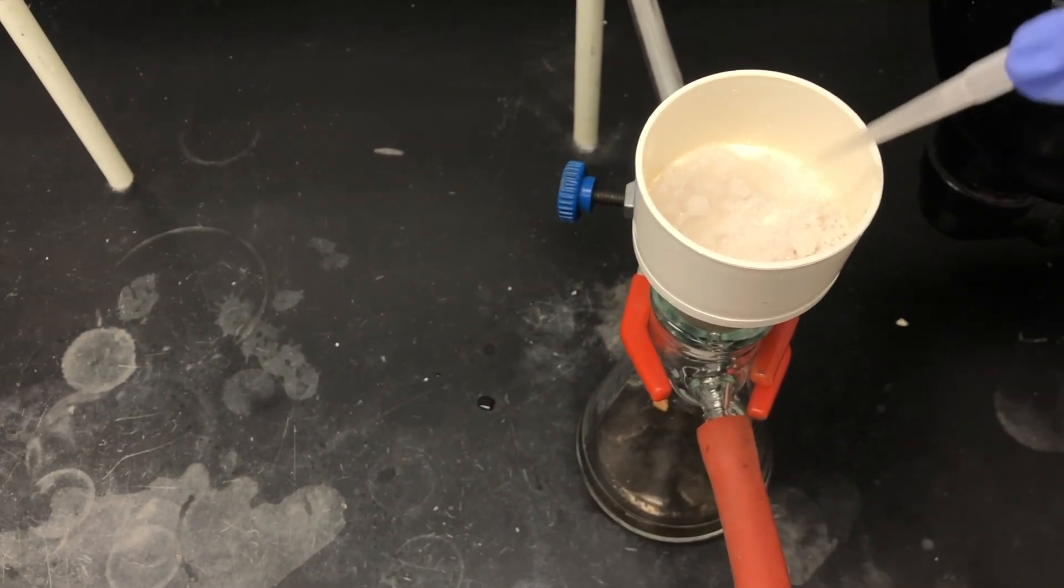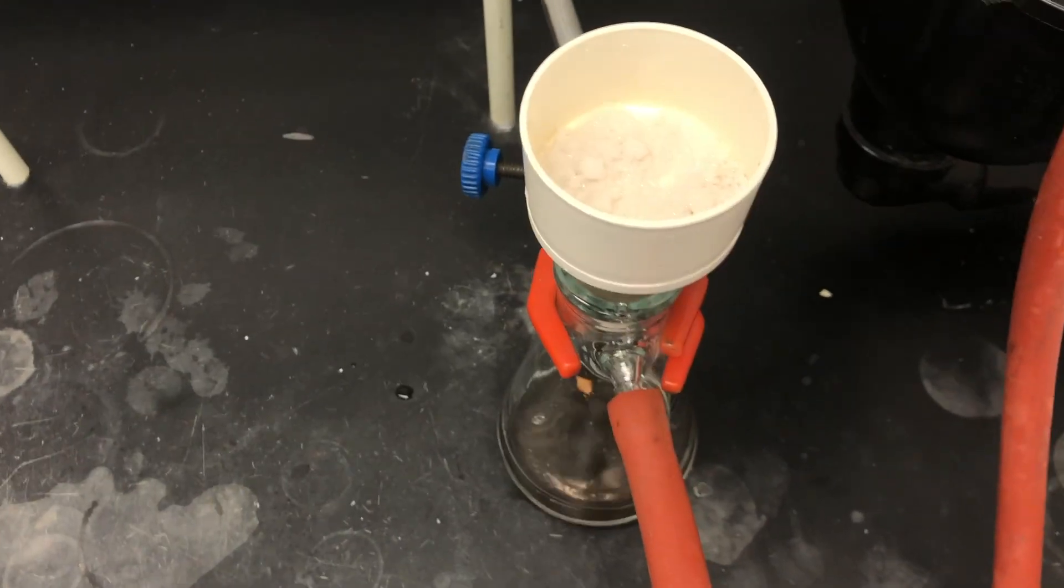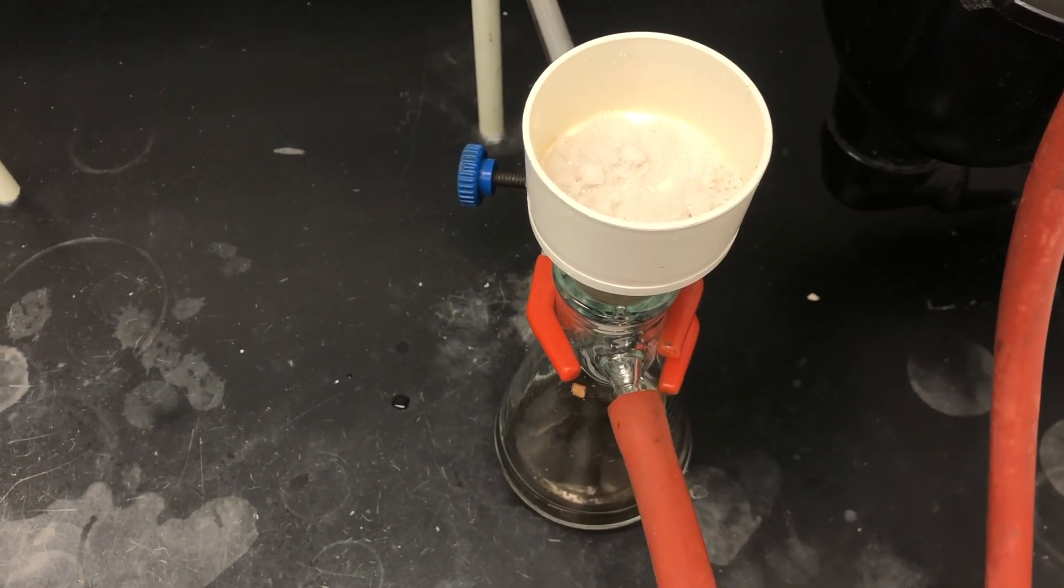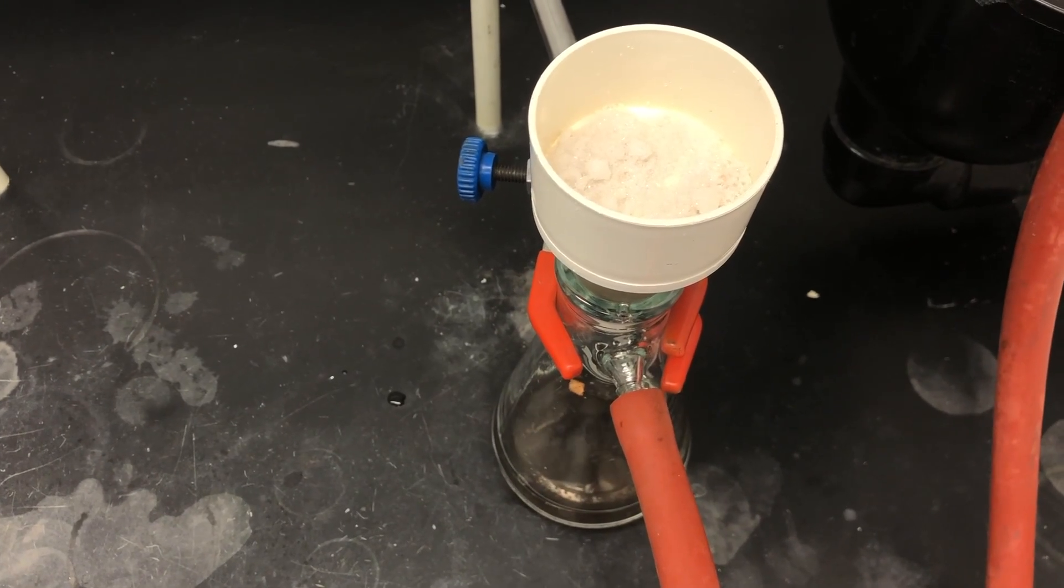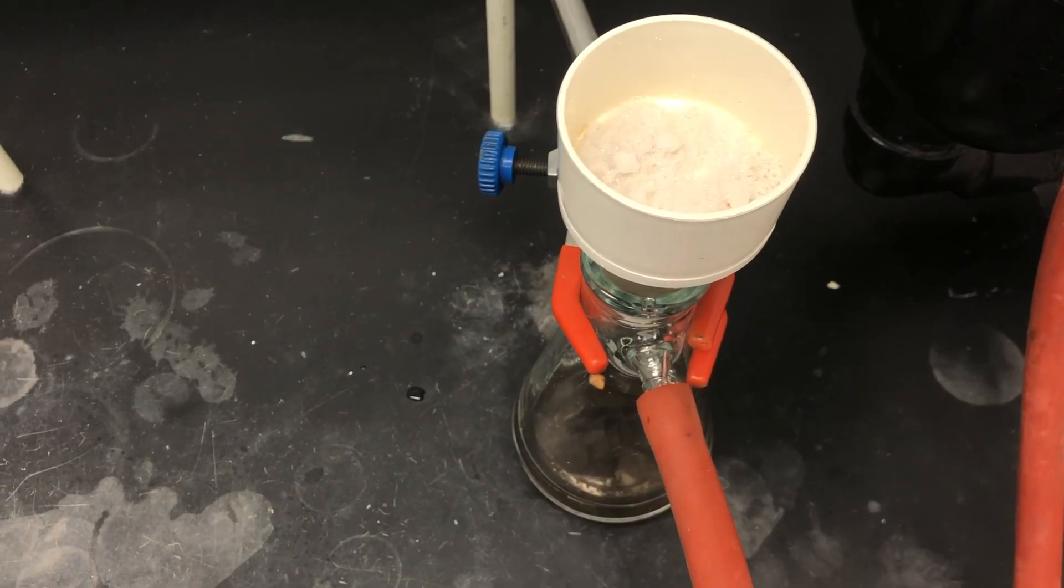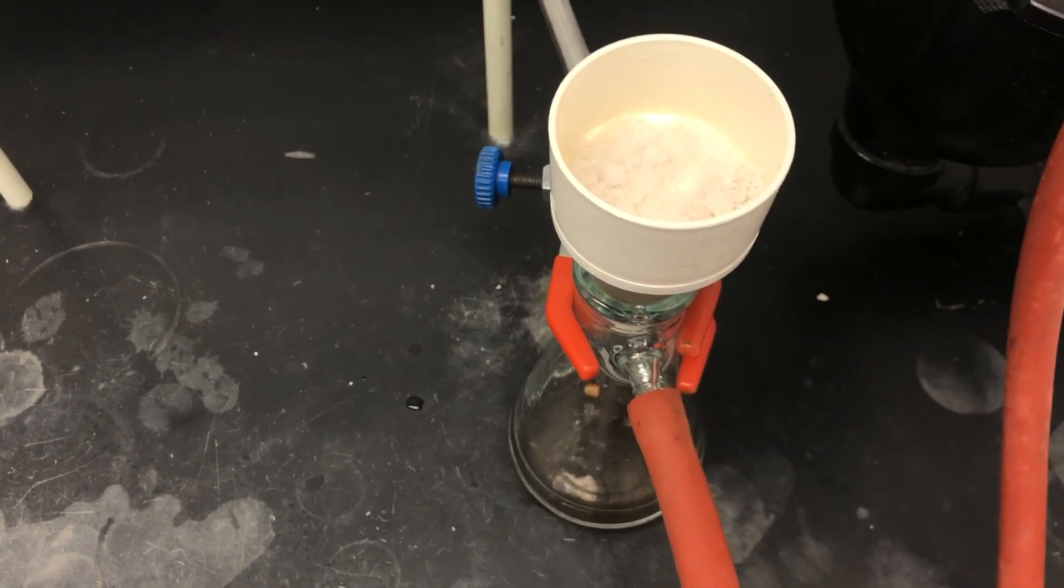By washing the product with two 3-milliliter portions of cold DI water, we ensure that any remaining acetic anhydride that hasn't reacted gets washed away as well.